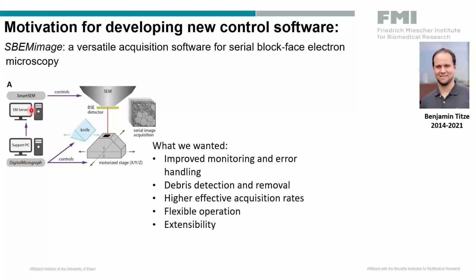What we wanted is to improve the monitoring and the error handling. We wanted also to have additional options with the program. For example, debris detection and also an option for removing the debris was one of the ideas of Benjamin to implement in SBEMimage.